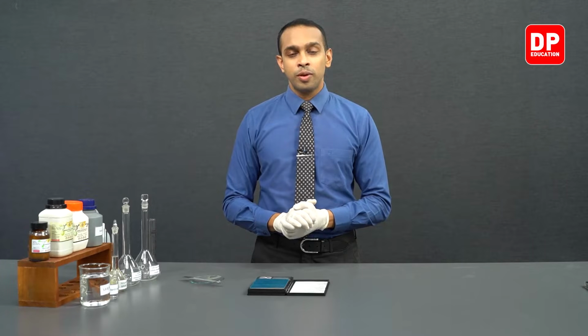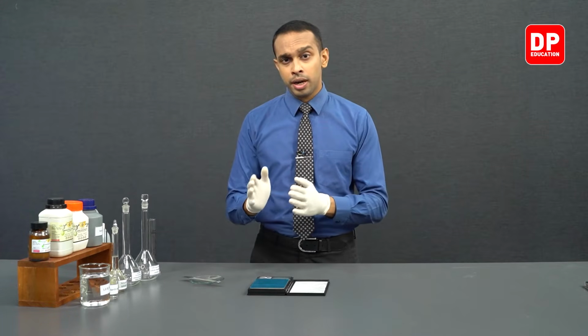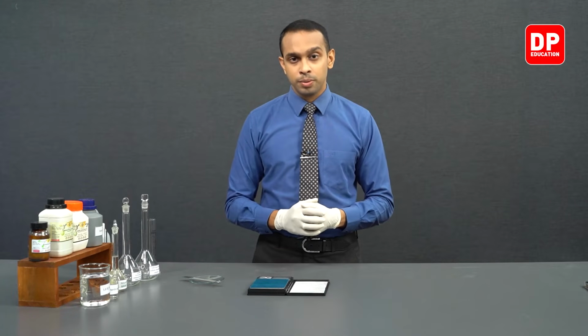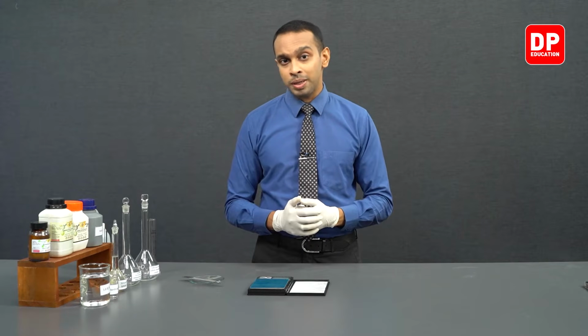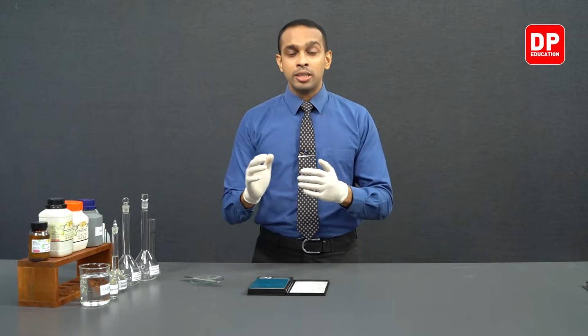Now students, we are going to observe how ammonium ferric sulfate solution is going to be made. This experiment observes the order of the reaction when we are reacting Fe3+ ions with iodide ions. So we saw earlier, in the early part of this experiment, we prepared a potassium iodide solution to introduce iodide ions into the medium. And in this part of our experiment, we are going to prepare an ammonium ferric sulfate solution to introduce Fe3+ ions into the medium.